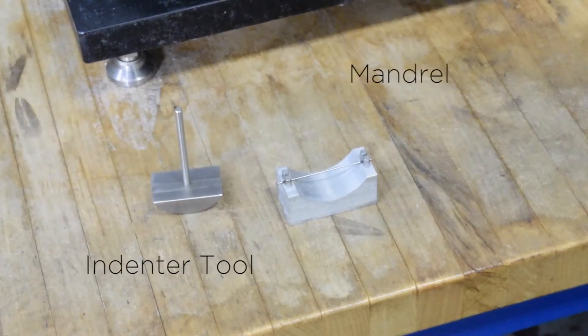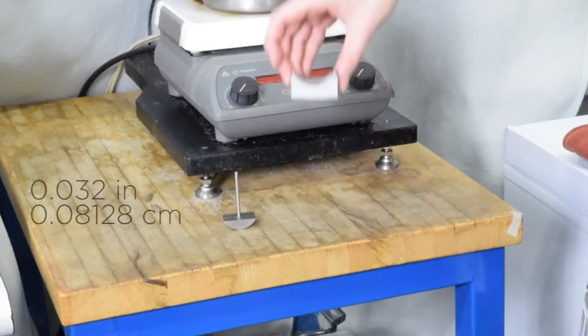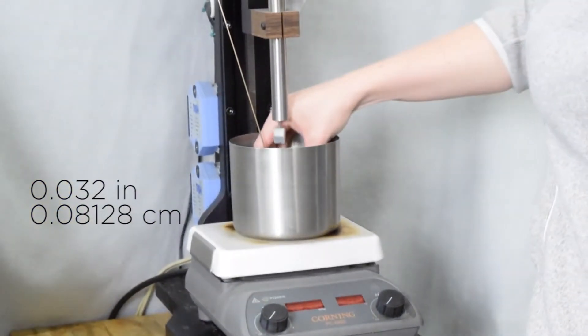For this test, you will need to use the mandrel designated for your specific wire size. We are using 0.032 inch diameter super elastic nitinol.